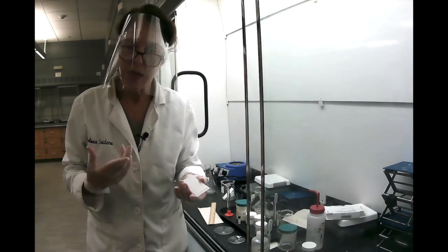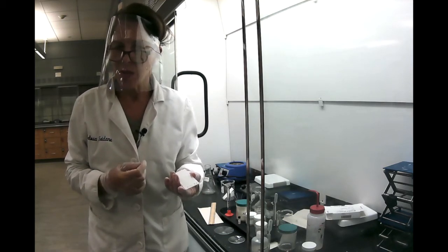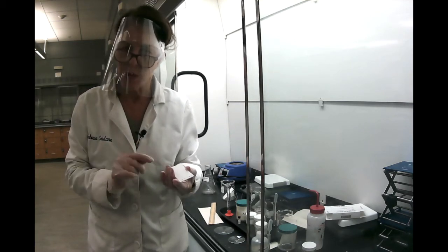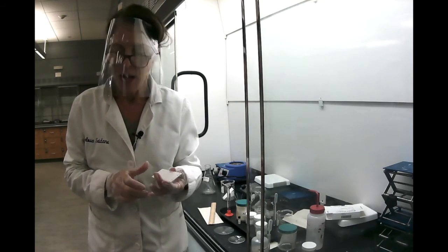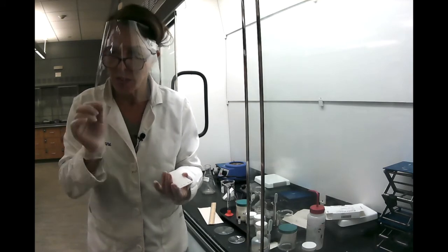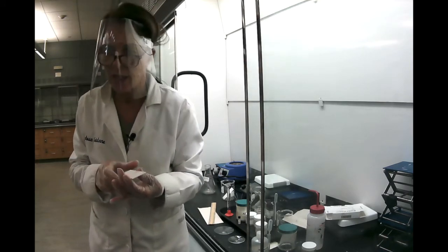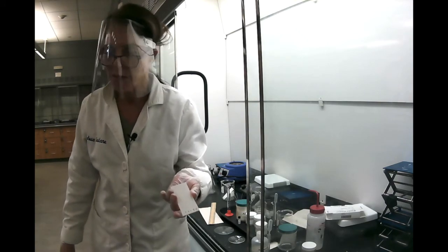There are two possibilities. Either your solution is too diluted when you dissolved your crystals and you're going to have very little substance, or you spotted too much liquid, you put too much of it, and you're going to have a concentrated one. It takes practice, and ideally just touch it once, but sometimes you have more than what you need on the TLC plate. So let's check it out and see how it looks under the UV light.